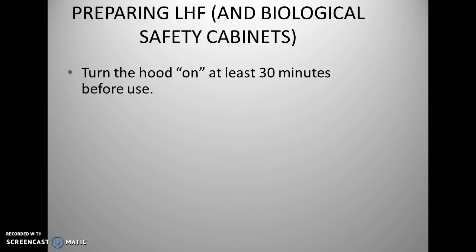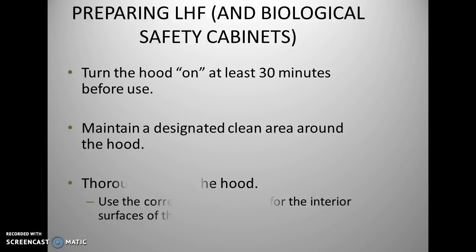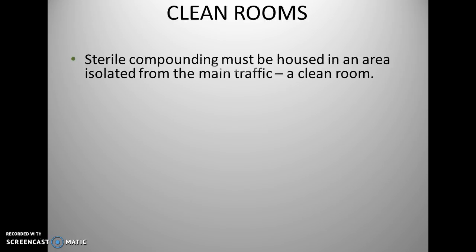Right. So this is how you work with laminar flow hoods or biological safety cabinets. You want to turn it on at least 30 minutes before use. You want to maintain a clean area around the hood. Okay, remember, because the air intake is from around the hood, you want to make sure the air that's going in is as clean as possible. You want to clean the hood, using the correct cleaning agent for the interior surface of the hood. Okay? This is very, very important because it's done not only to protect the materials and make sure they're sterile, but also to protect the individual.